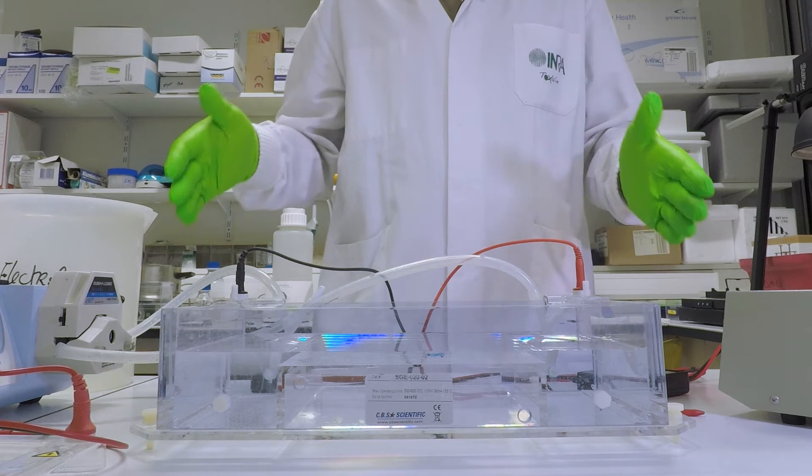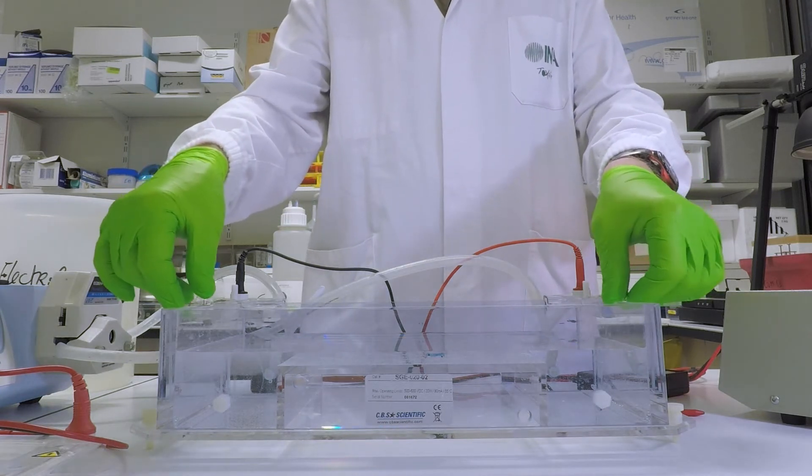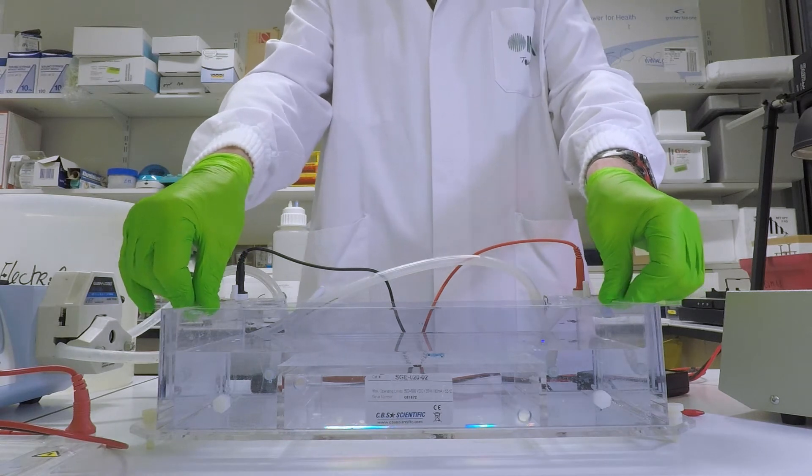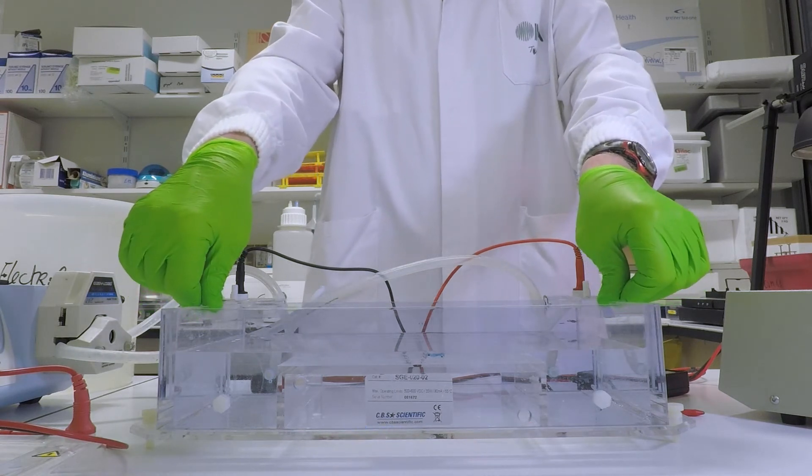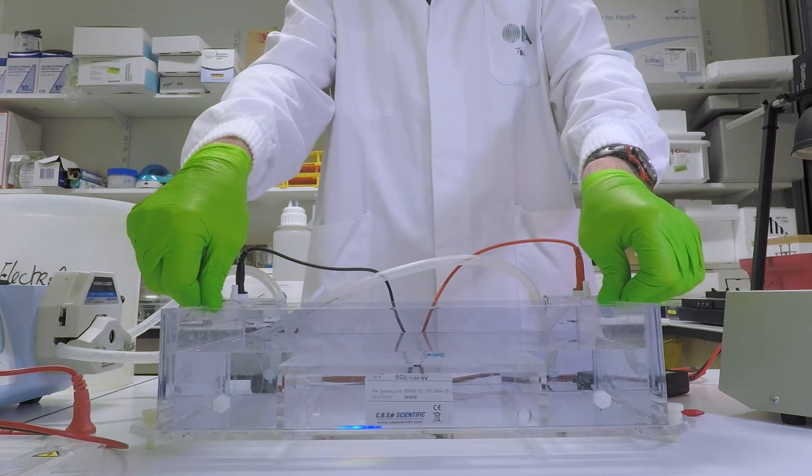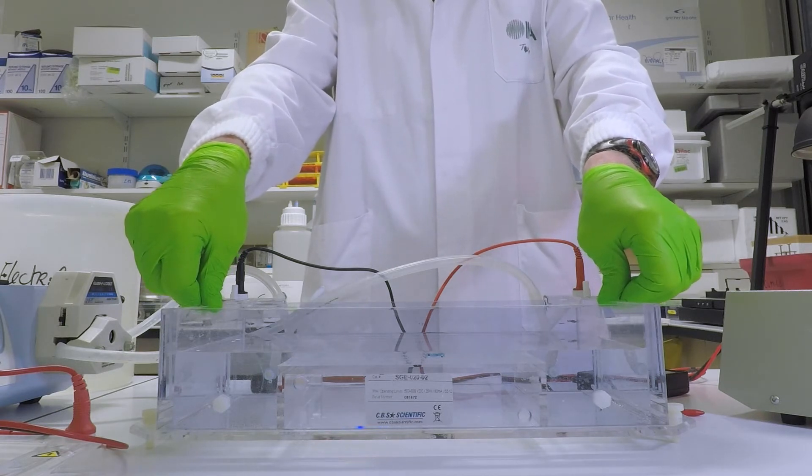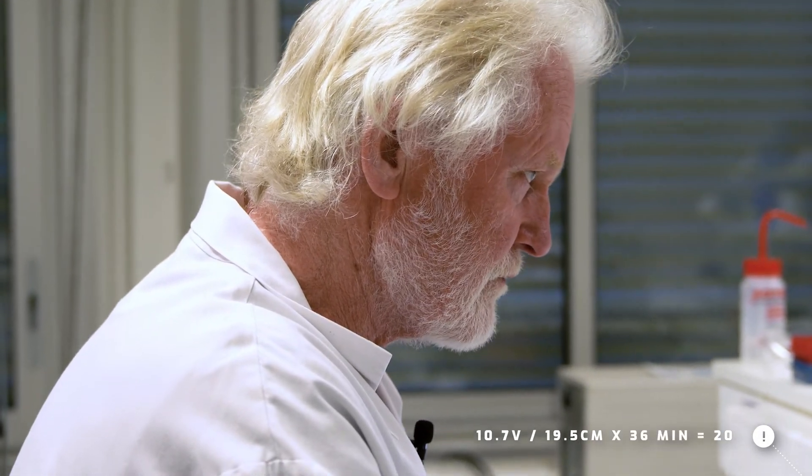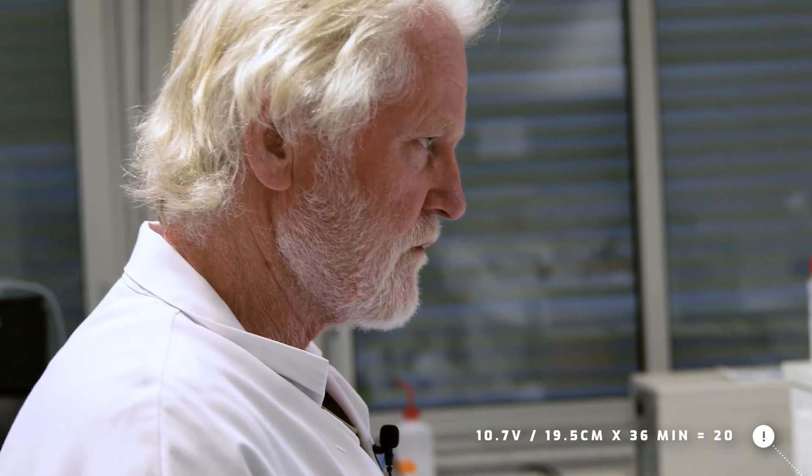This electrophoresis tank might be a bit longer than other people are used to. So, therefore, in this case, we get a good demonstration of how important it is to adapt the voltage. Not only the voltage, but also the duration of the electrophoresis to the volt per centimeter. So, therefore, for this tank, under these conditions, we should run the electrophoresis for 36 minutes.